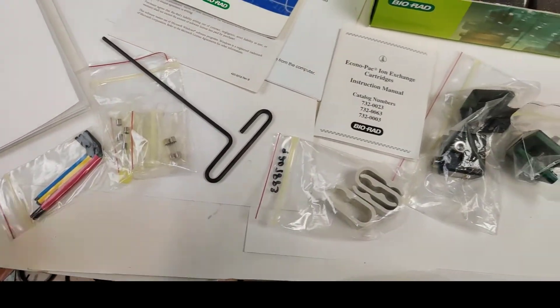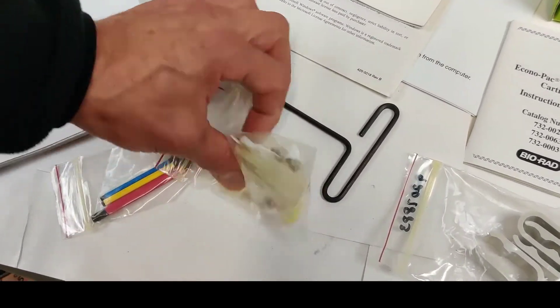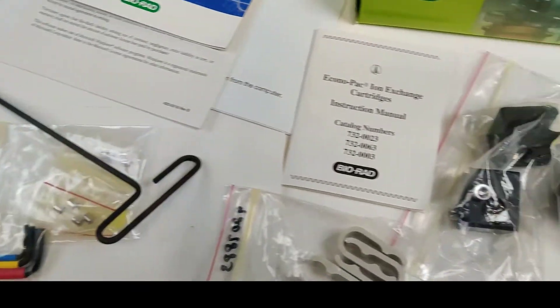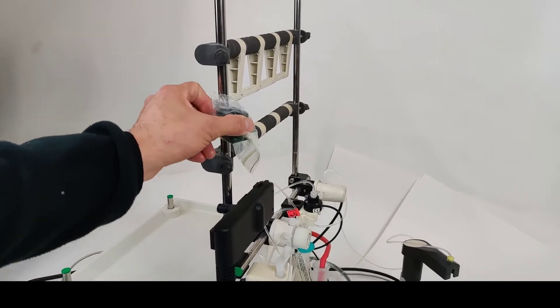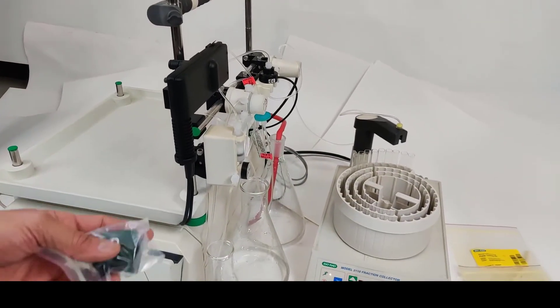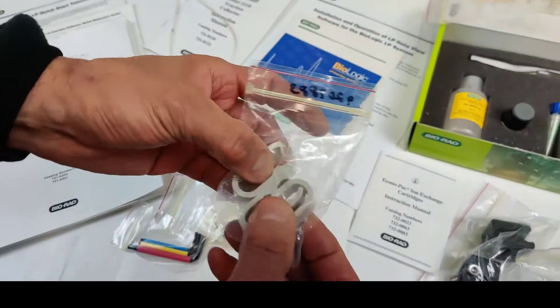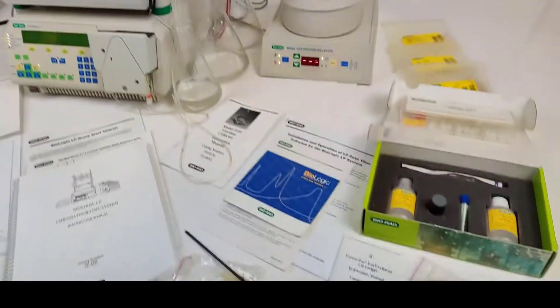In the kit you have the fuses, wrenches, other wrenches. Additionally, the clamps to hook up the different elements on your combs here, and also these clips, if you need them, to hook up additional elements.